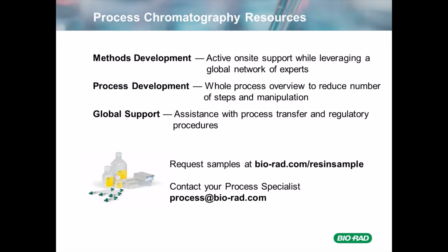Thank you. The first question we have is, besides changing buffer pH and NaCl, what else can I try for improving target selectivity and recovery?